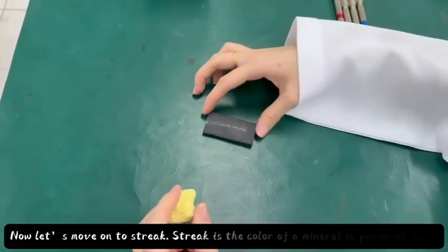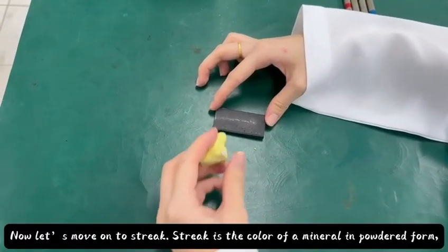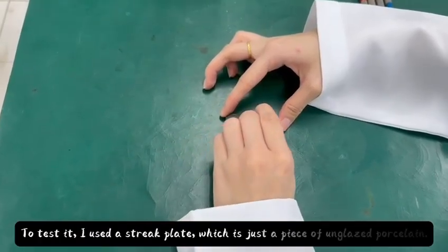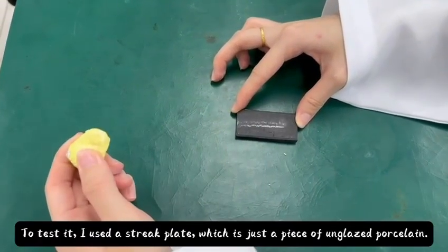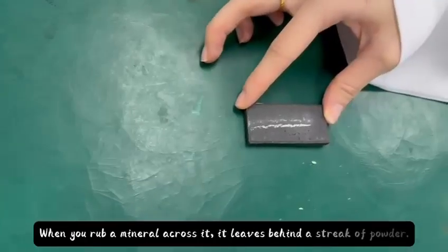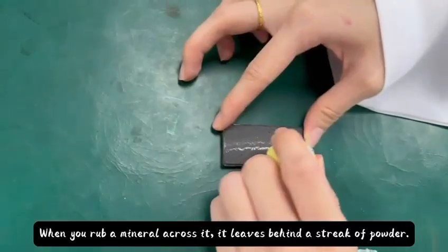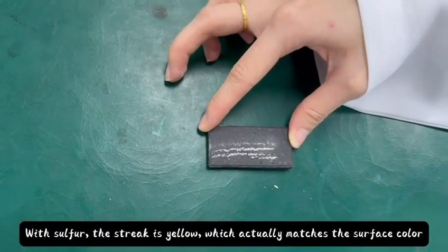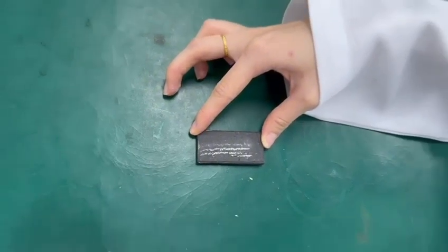Now, let's move on to streak. Streak is the color of a mineral in powder form. To test it, I use a streak plate, which is just a piece of unglazed porcelain. When you rub a mineral across it, it leaves behind a streak of powder. With sulfur, the streak is yellow, which actually matches the surface color.